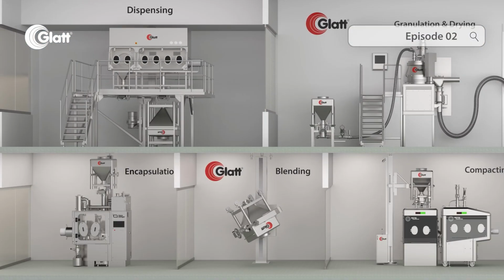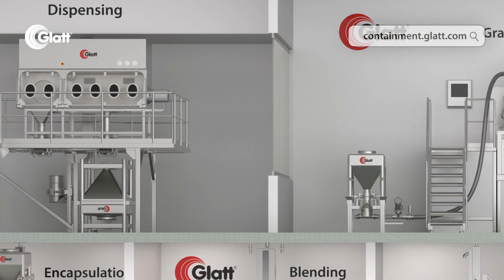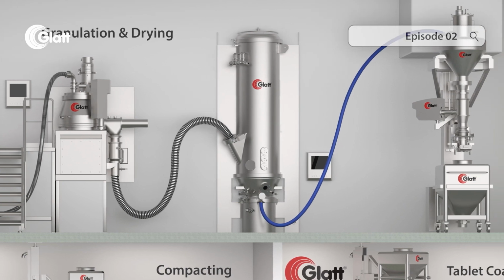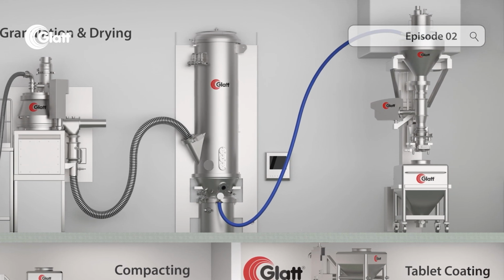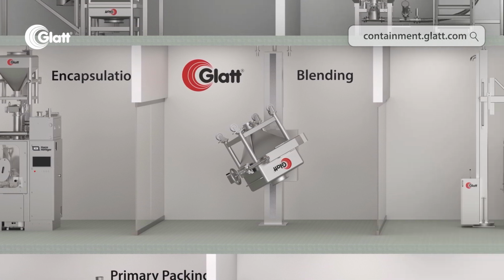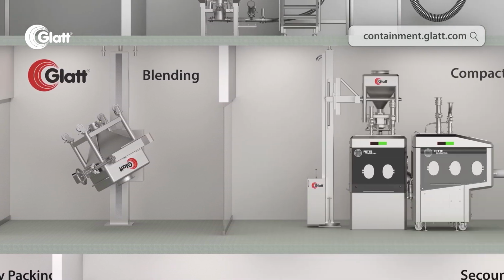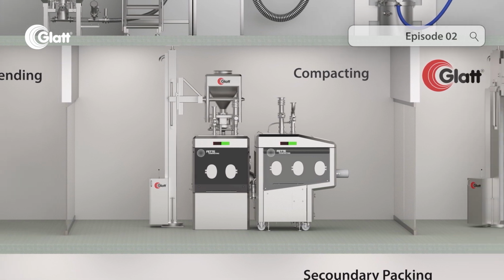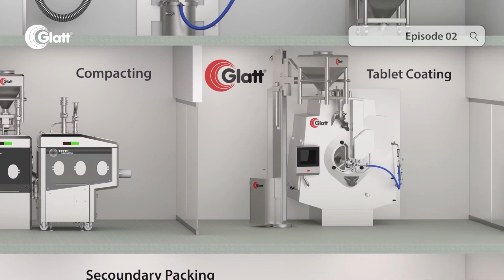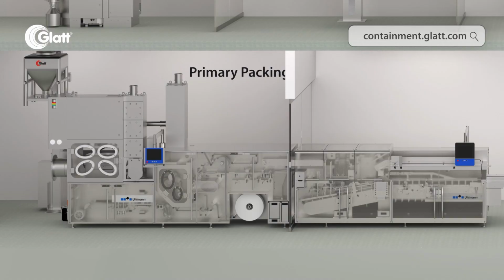We start with dispensing, move on to wet granulation in a high-shear granulator, and then to drying in a fluidized bed system. From there, we move on to sieving, and after that, the addition of excipients, blending, and finally to the tablet press. The finished tablet is usually coated in a coater and blistered before being packed.